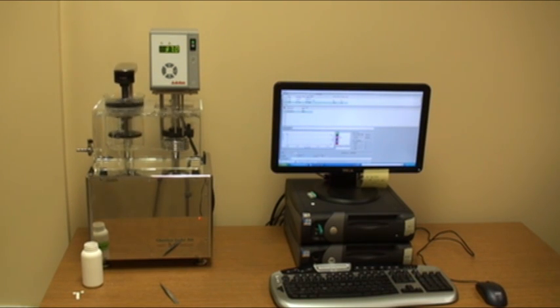The Dissi is operated with a PC using PH-21 software. PH-21 software was designed by IRL specifically for the tablet testing industry and is 21 CFR part 11 compliant.